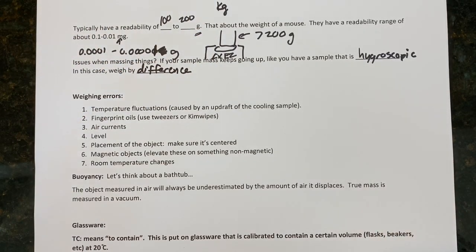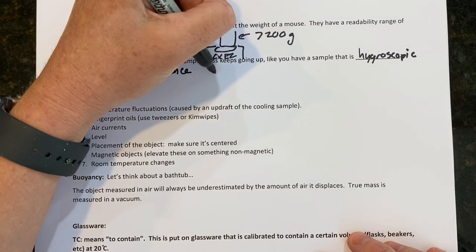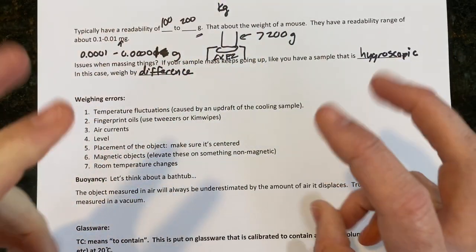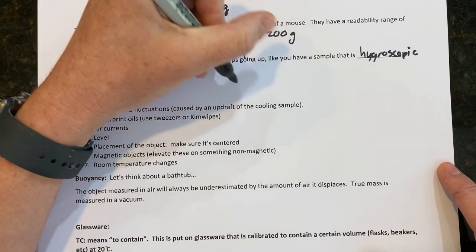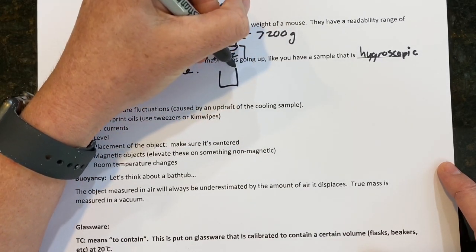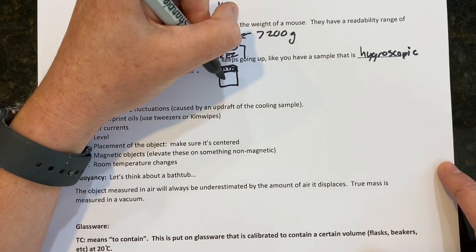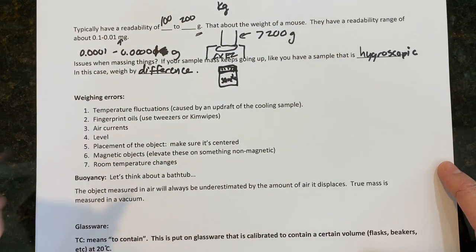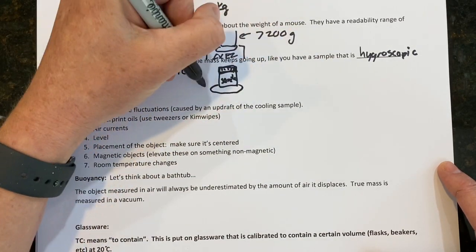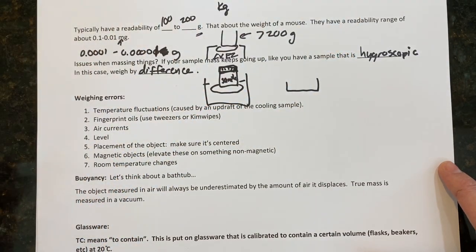So I believe you have a lab number 5, where you're going to be needing to weigh something by difference. And when I say you're needing to, I mean I will weigh something by difference for you, and you can watch it. What that is, you're going to have a sample inside the container, and usually you even want to keep the lid on the container. Let's say you want to take 1 gram out of this. So what you're going to do is put the entire sample on a balance, and over here have the container you're putting your 1 gram into.